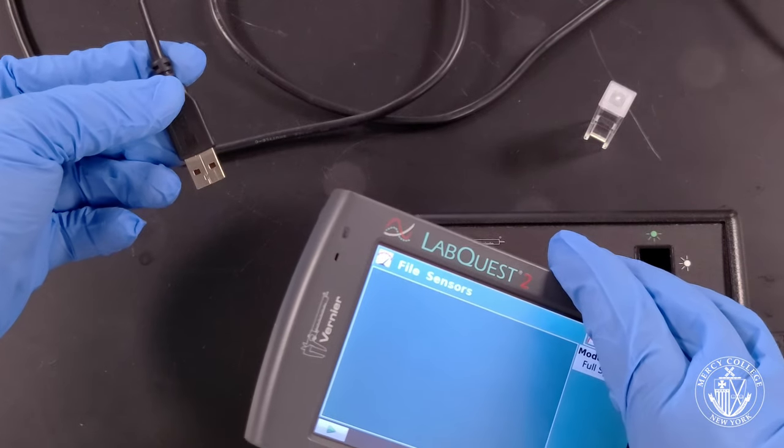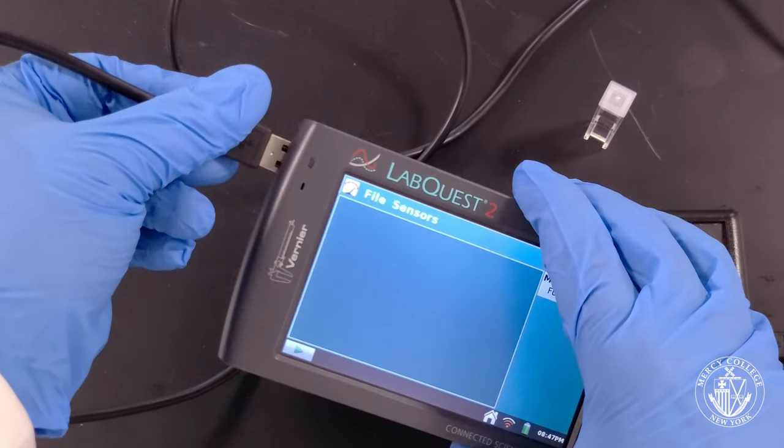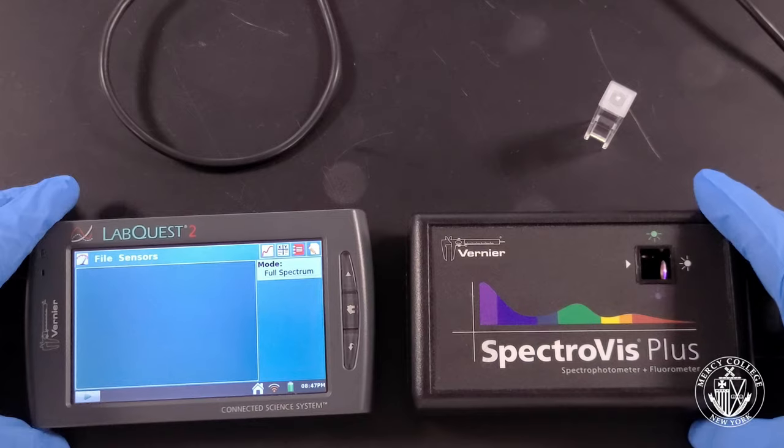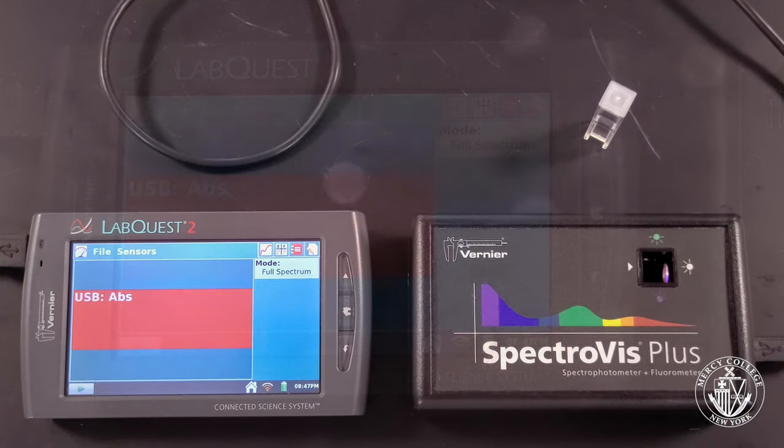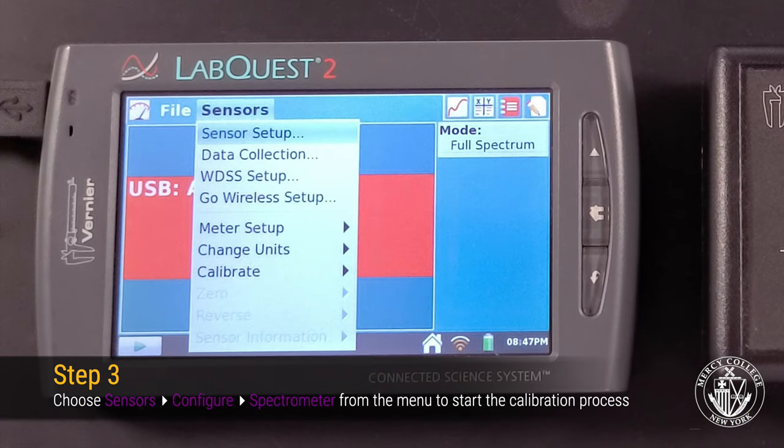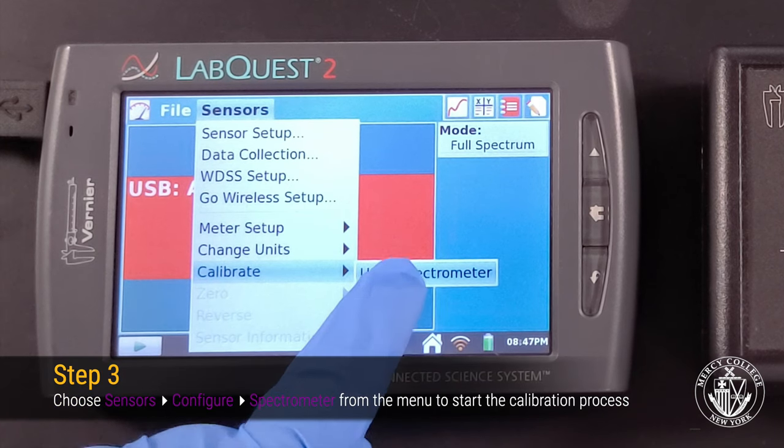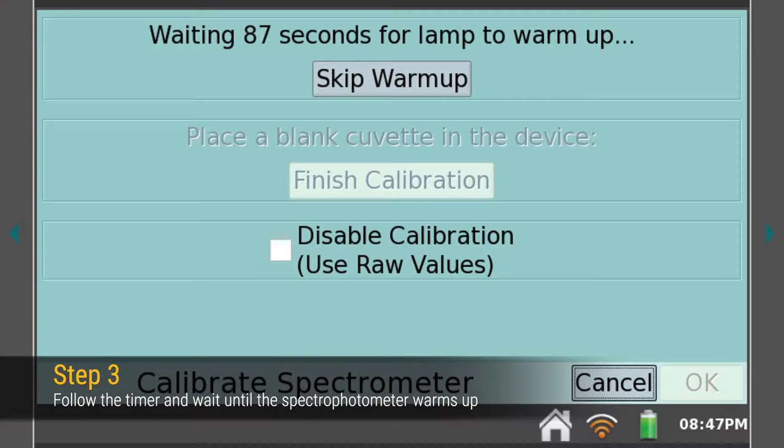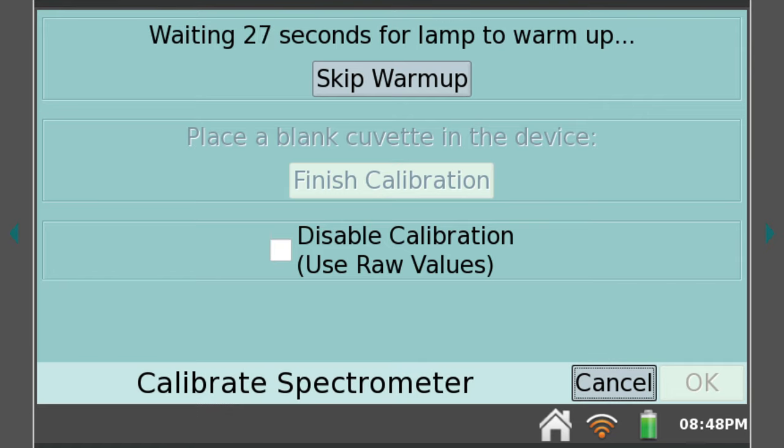Once you've correctly attached the spectrophotometer to the LabQuest, you should see a screen that registers absorbance. Before we can use the spectrophotometer, it needs to be calibrated. To do this, we select Calibrate from the sensors menu. This will initiate a warm-up timer for the lamp, allowing us to get consistent results whenever we use the spectrophotometer.